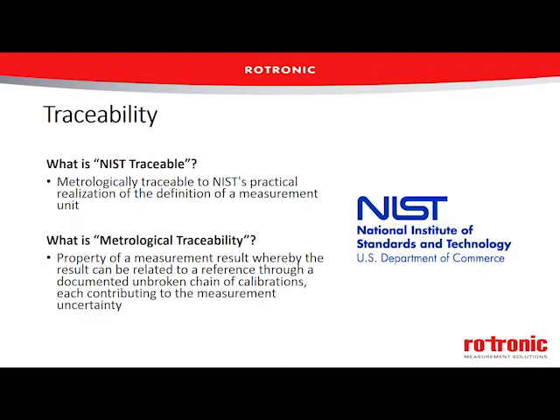So when people ask for calibrations, I've heard a number of different terms used to describe traceability. People will ask for a NIST cert, or I've heard I want to get my instrument NISTed, or I want a traceable calibration. Now, what is traceability, or what are people asking for here? Really what's being asked for is traceability of their instrument back to the fundamental definitions of what that parameter is. Now, technically that's not going back to NIST's definitions of it.